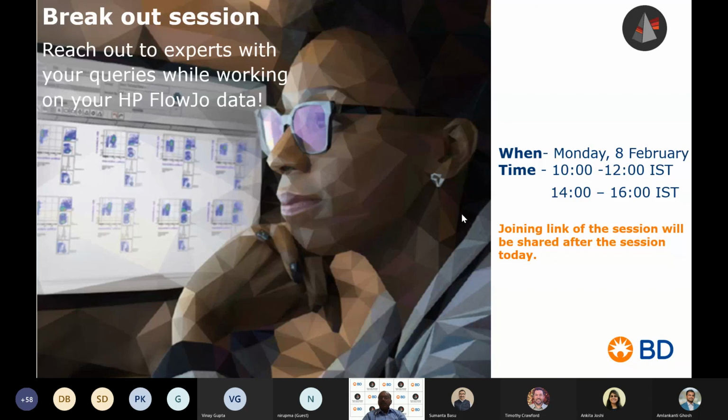Thank you, Dr. Sumanto. And before that, please get your FlowJo software connected, downloaded, and functional, and then you can have your plugins installed into it. I'm sure the invites have been sent to most of you for access to FlowJo, or you might be using your own FlowJo. I'm not very sure because I have not seen 100% acceptance of the links. So probably you must be using your own FlowJo. Before you get into the plugin session, ensure that you have a functional FlowJo on the same computer which you are using, and then you can join the plugin session. So with that, thank you very much.